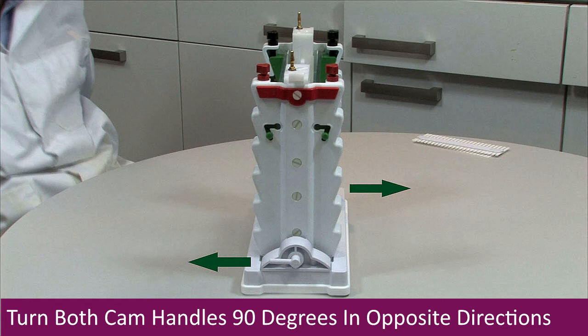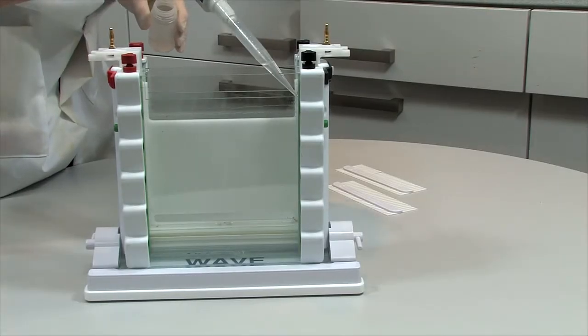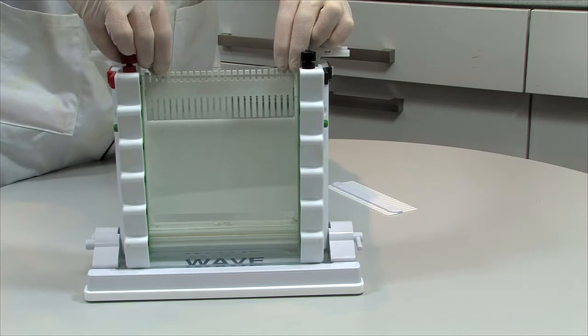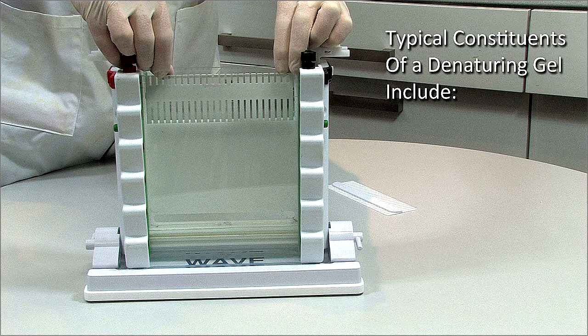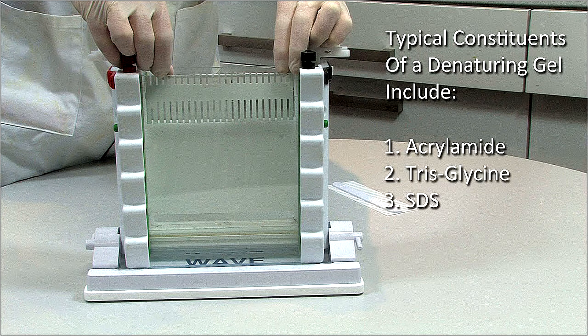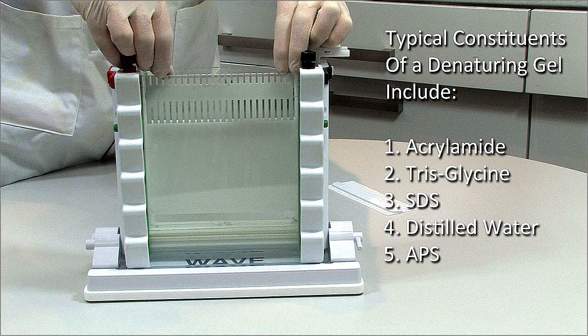The gel solution is now poured between the glass plates and the combs inserted. Typical constituents of a denaturing gel include acrylamide, tris-glycine, SDS, distilled water, APS, and TEMED. The standard gel formulation may vary according to the acrylamide percentage, usually higher in a resolving gel, but the constituents remain the same.